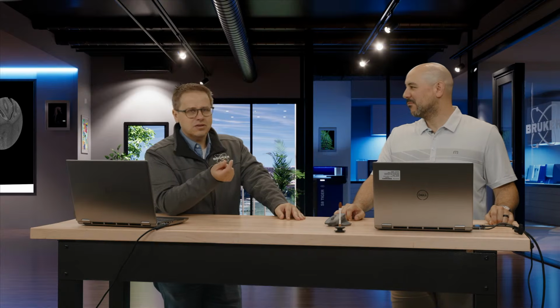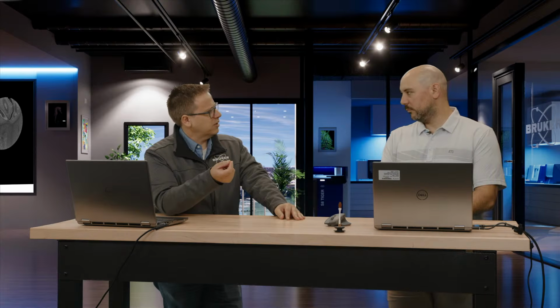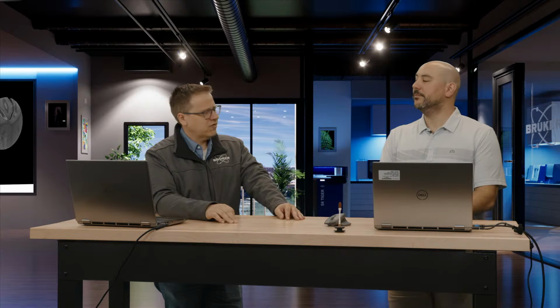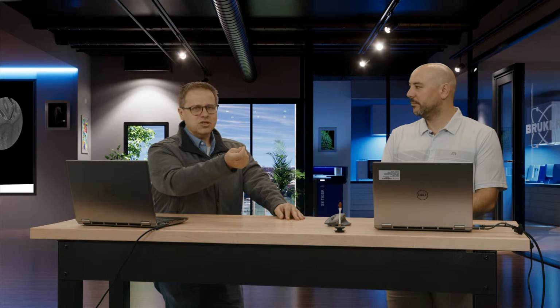They also have these standards. Whenever we qualify an instrument, it's called QRM. You can go online and search QRM micro CT. You might have one with your system, and if not, you can order them online. That's like a 3D standard. You stick it in your machine, run it under the conditions, and look at the result. You get a number because it has these patterns, the standard micron line spacing, things like that. That's also a nice thing for a novice who's trying to get used to things and have some ground truth.